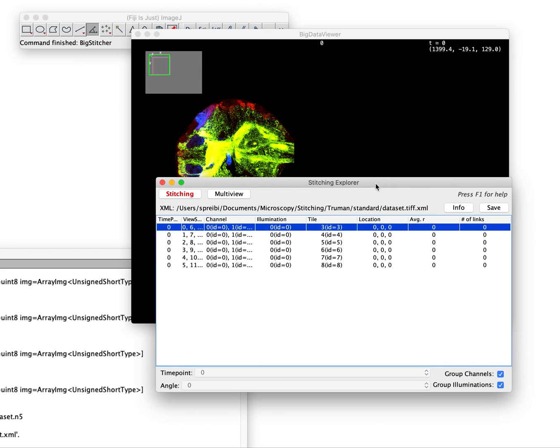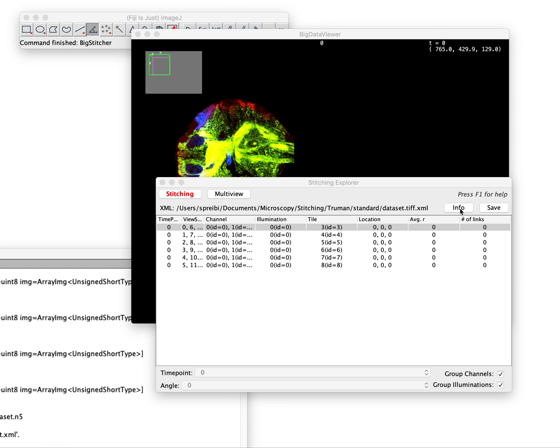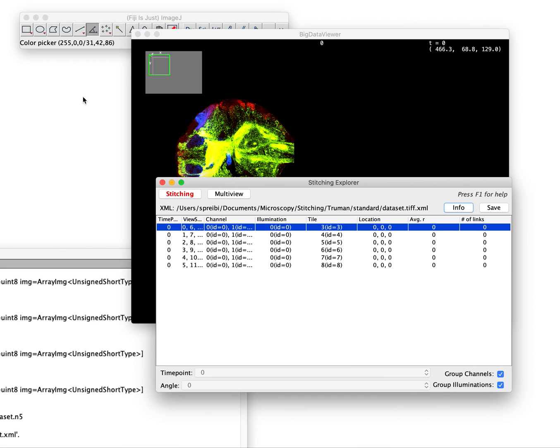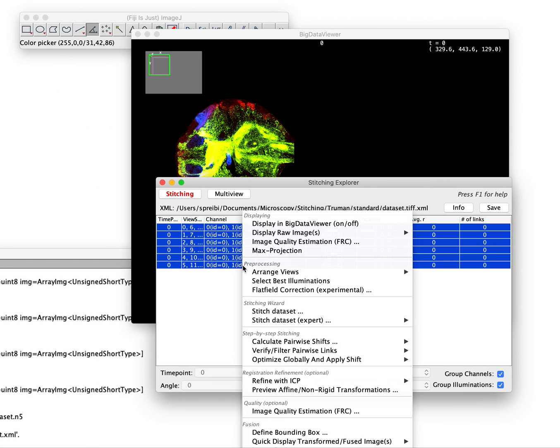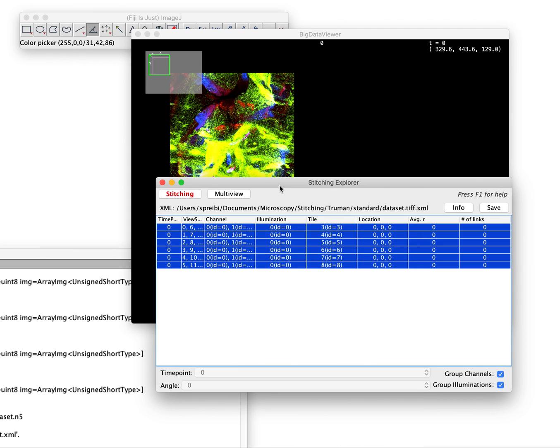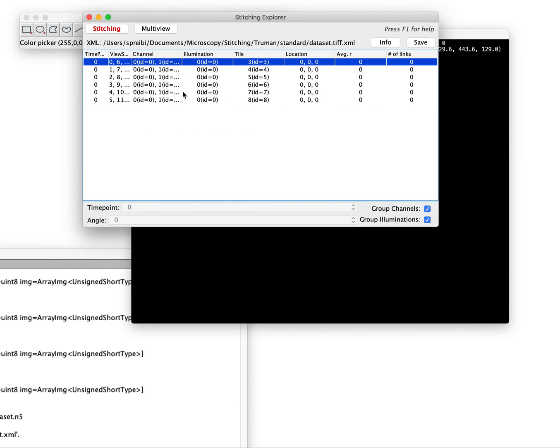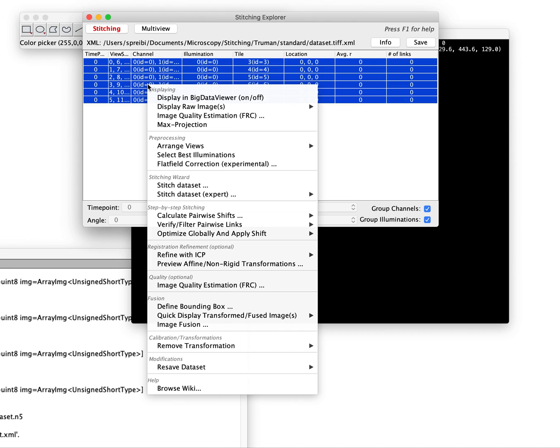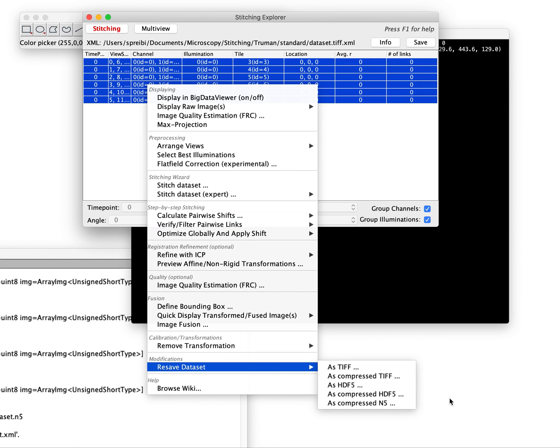If you're actually not sure what kind of image loader you're currently using you can press here on info. The info will tell you what kind of image loader you're using. This is a bioformats based loci image loader. Now we could basically go here and say select everything. That's important. It will only resave the ones you selected. That's actually if you go to resave this way you can say I only want one channel, I only want the first 50 time points and so on.